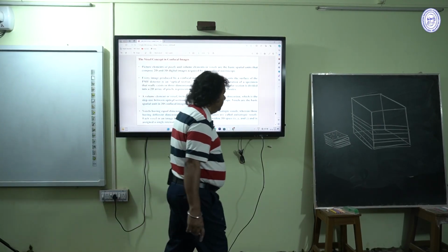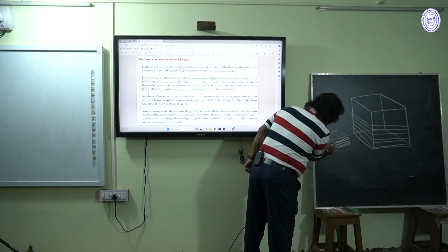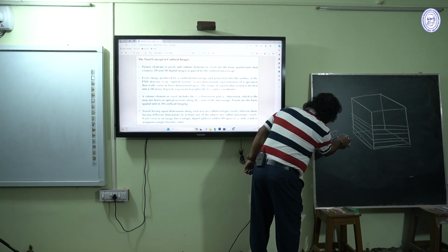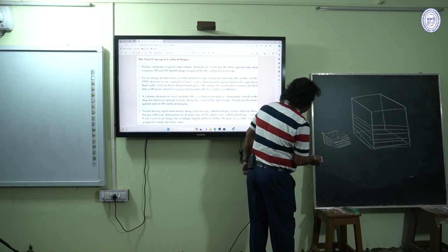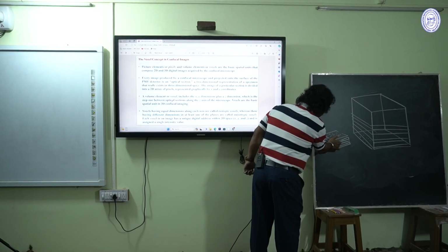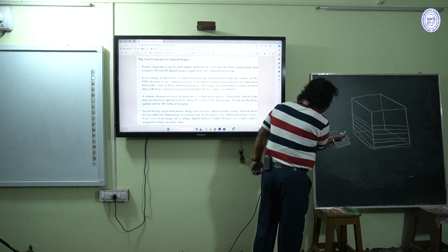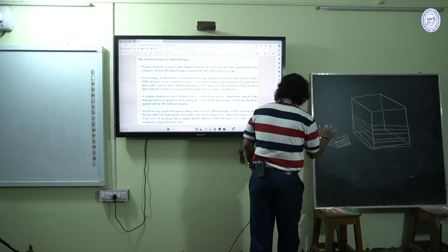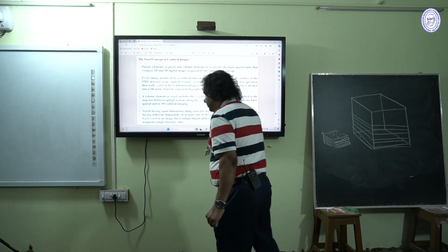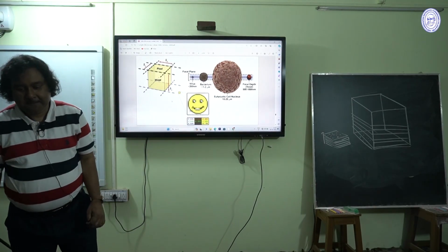Okay, so it is pixel XY direction, it is the Z axis. So different layers having the same type of pixels is isotropic voxel. Different layers having different numbers of pixels are simply known as anisotropic voxels. Yeah, please try to understand.